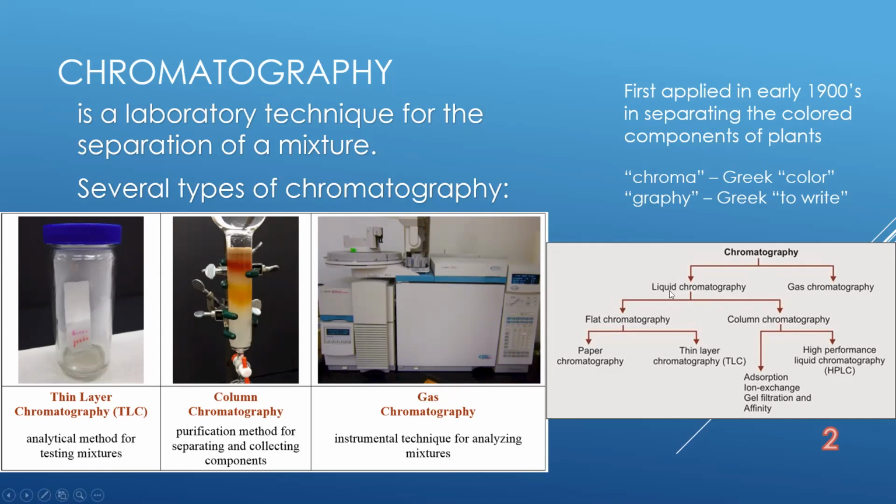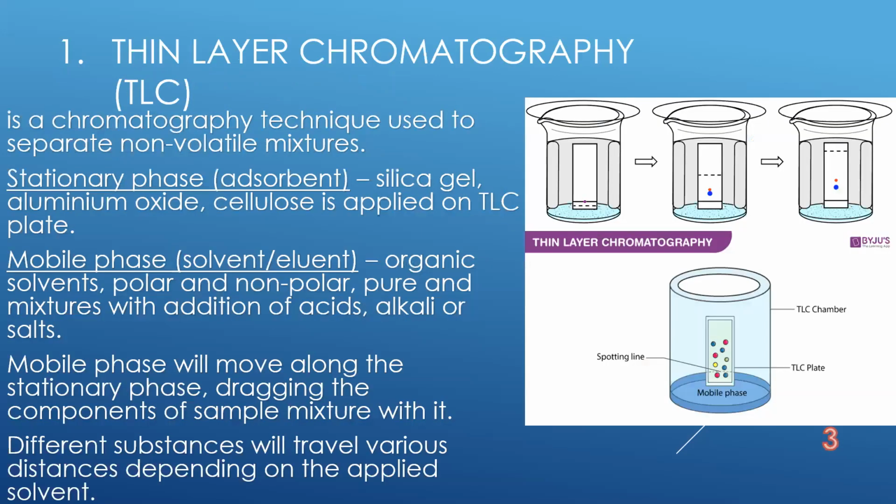It can be connected to liquid chromatography because it has a liquid mobile phase. So about the thin layer chromatography, this method is also a method of separation, such as all chromatography methods, analysis and physical and chemical research of non-volatile substances.